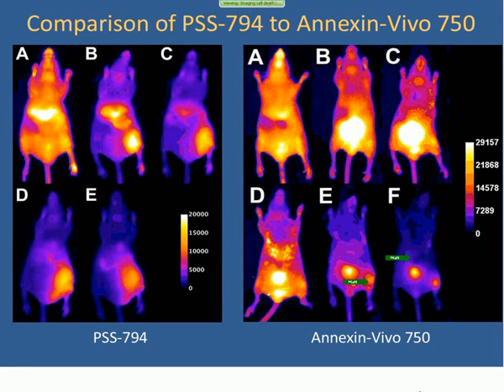So the annexin results certainly verify that phosphatidylserine was exposed in this tissue model, but our take-home message and our conclusion from this is that perhaps our probe is more appropriate for this type of tissue damage model, where you're looking at the legs in a sort of highly controlled system, versus over here where you're looking at the legs and the bladder is saturating your signal.